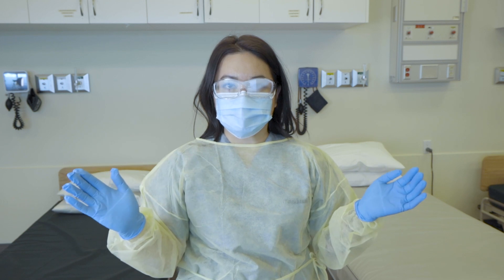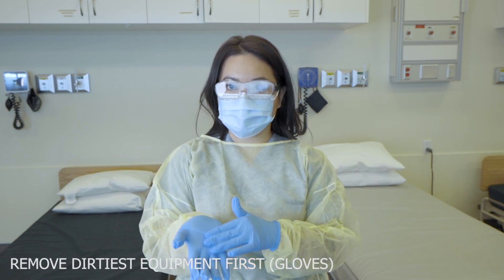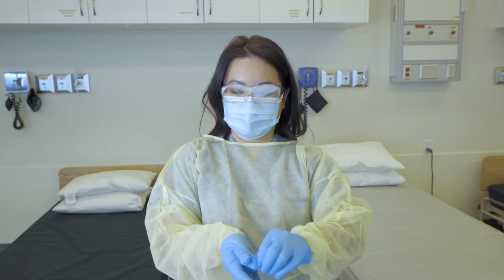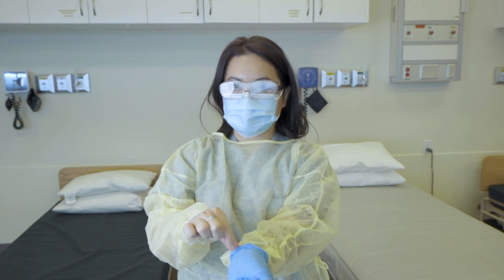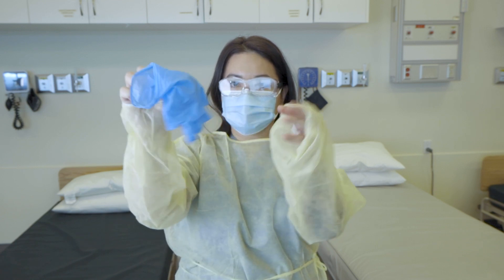For removal, we want to make sure that we're removing from dirtiest to cleanest, starting with the gloves. Grasping at the palm side, remove one gloved hand, and then using the thumb of the other, hook onto that cuff to remove the other glove.